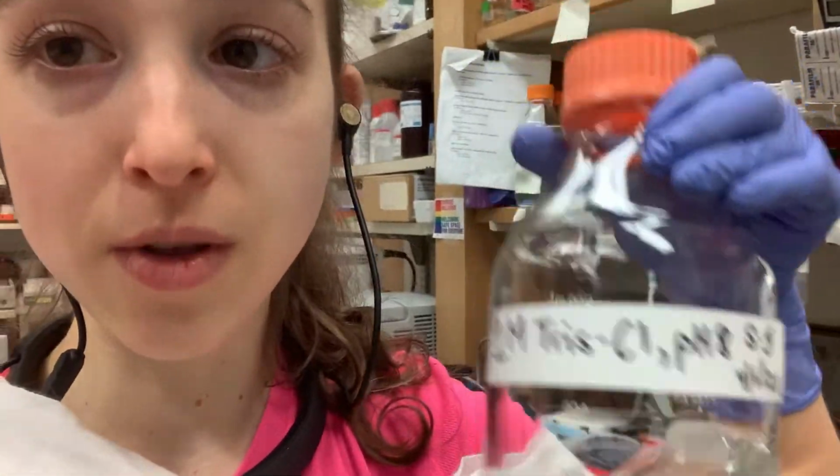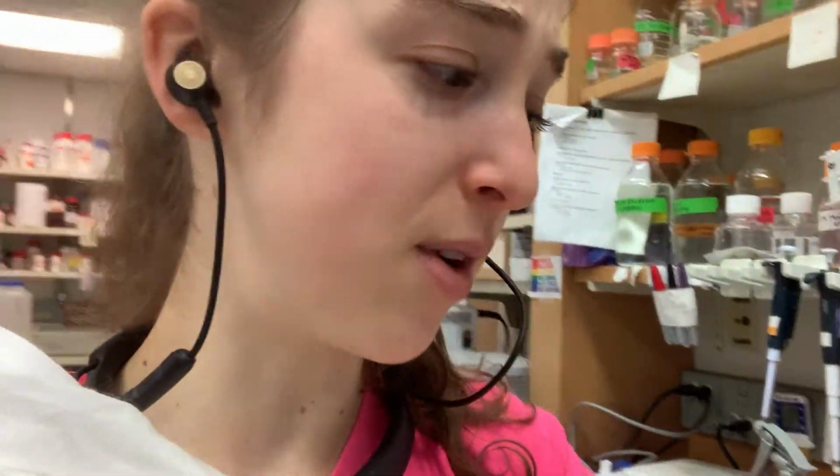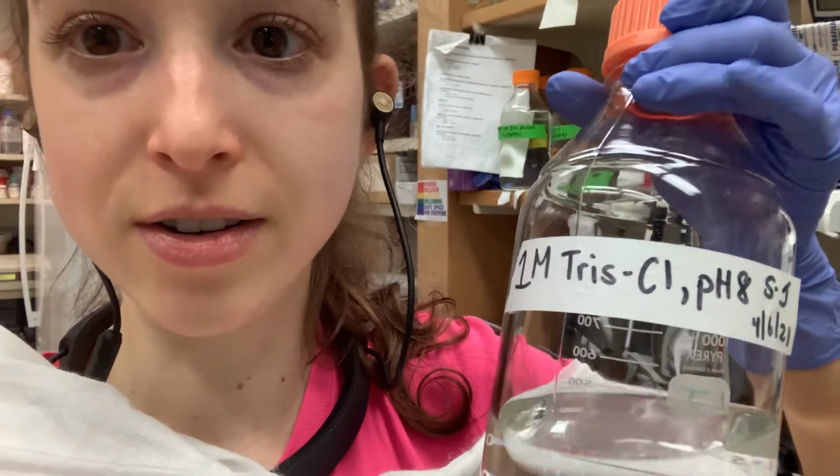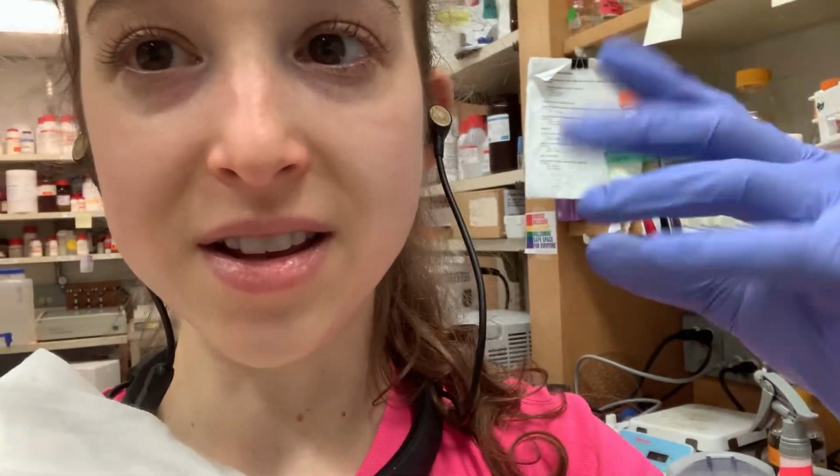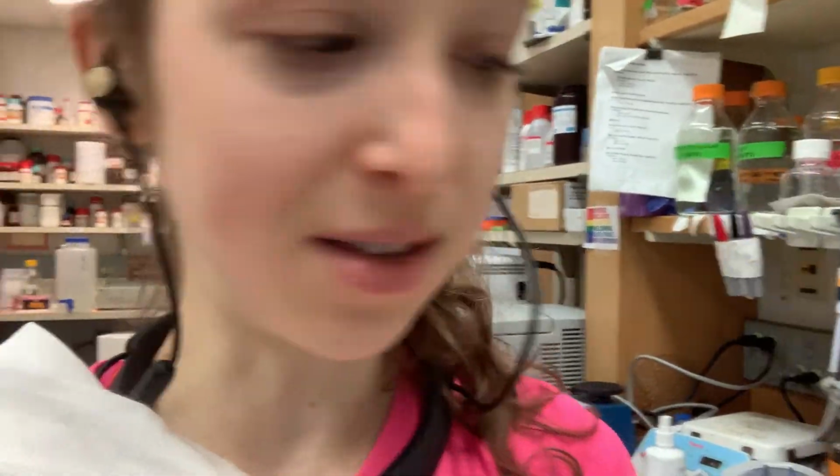Like 1 molar is really useful because you can easily see the V1 calculation. If you wanted a 50 millimolar solution in 1 liter, that would be 50 mLs of this, and then you fill it to a liter, and 25 would be 25, that sort of thing. And if you only have 500 mLs, you have that in your head, so you can do easy mental math.